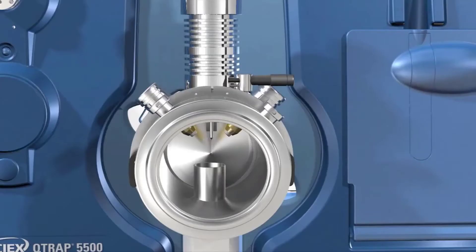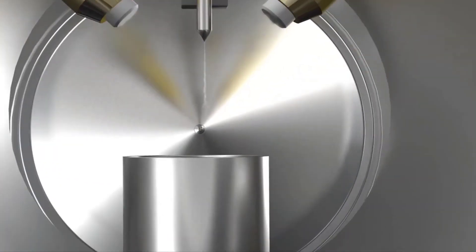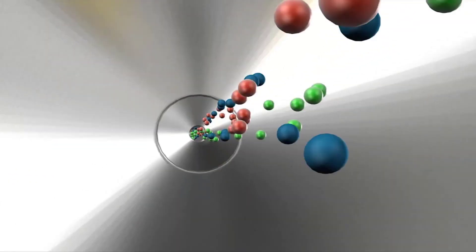In the ion source, the sample is converted into charged particles called ions in the gas phase. The most common example is electrospray ionization. From there, the ions enter the mass analyzer.